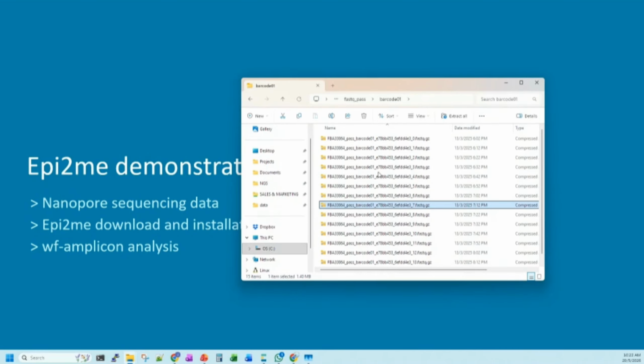So in case you are getting your data from a public database or from your collaborator or some suppliers, you might be getting one FASTQ file per sample. That is because they have concatenated or put together all the FASTQ files that are generated, in cases like this.